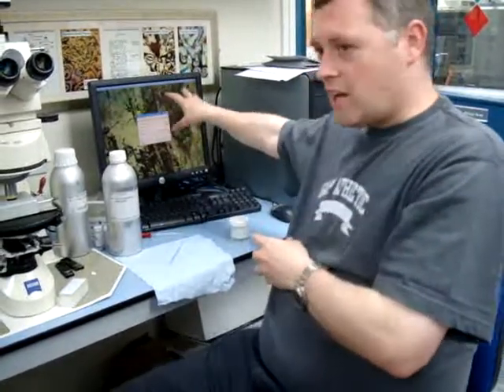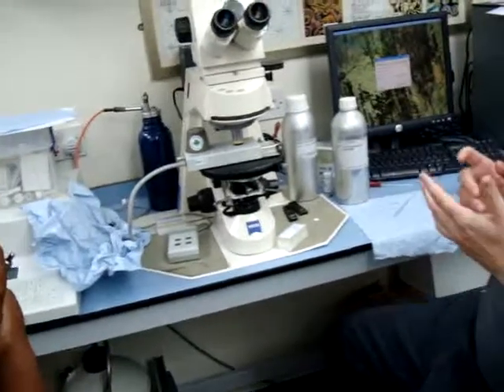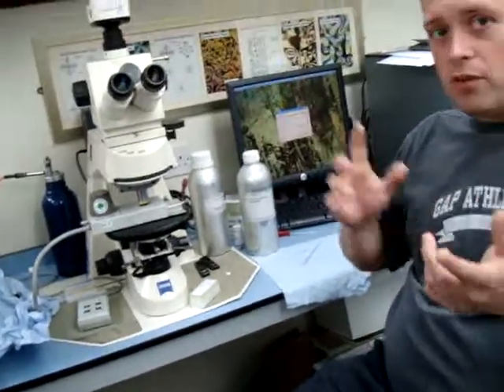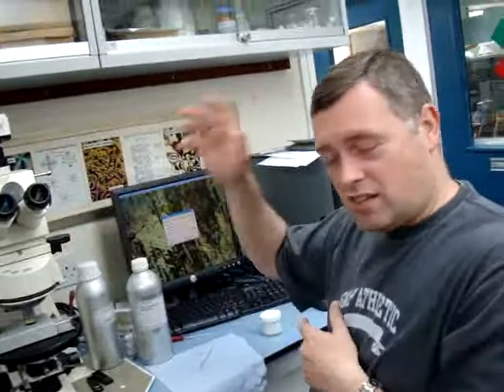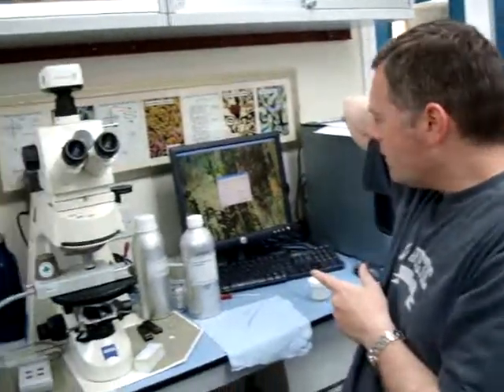Obviously, for liquid crystal textures, you're getting interaction with the light, so you're seeing all the different optical textures based on the defects that are there. Now, as I say, depending on the phase, you get lots of different optical textures, and that's what we're going to try and go through some of the basic ones here.